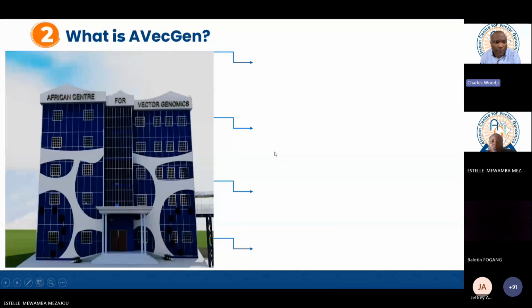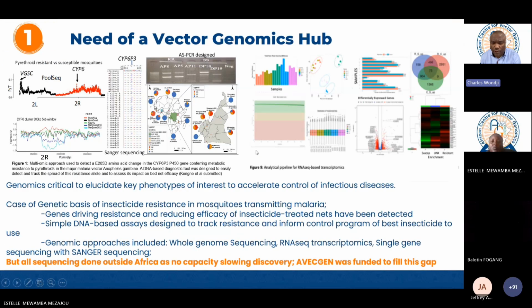So we will come back to the Q&A, but first, that previous slide, Estelle, was just to show you again where we started, hoping this time that the quality is better. I was highlighting the power of genomics and what led us to be involved in this field. We are heavily working on infectious diseases. Among them, you have malaria. Malaria is prevented mainly by using insecticide-treated nets, but mosquitoes have developed a way to avoid being killed by those insecticides. And the answer is in the DNA.